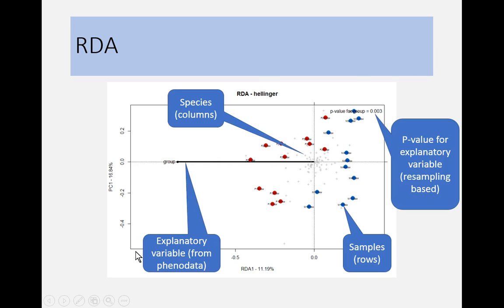So you have two axes where you display all the data you have. So you have here, for example, the samples, which are the big colored dots, and these are colored by the group. If I now recall right, the red ones are from group 1 and the blue ones are from group 2. So these are the samples. Then you have the species or the bacteria that you have measured. Those are the gray dots. You see the gray dots? Good. Because not everybody does. So those gray dots there, they are those bacterial species.